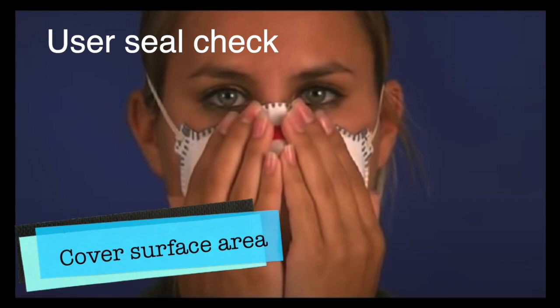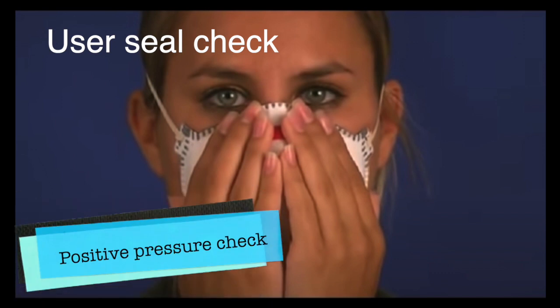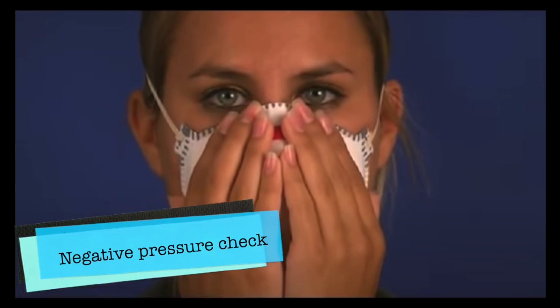To perform a user seal check, cover as much surface area of the mask as you can with your hands, ensuring not to push the mask into your face when doing so. To perform a positive pressure check, exhale gently into the mask until it bulges out. Make sure that no air has escaped around the edges when doing so. To perform a negative pressure check, inhale more forcefully until the mask collapses, ensuring again that no air has escaped around the edges of the mask into the mask itself.